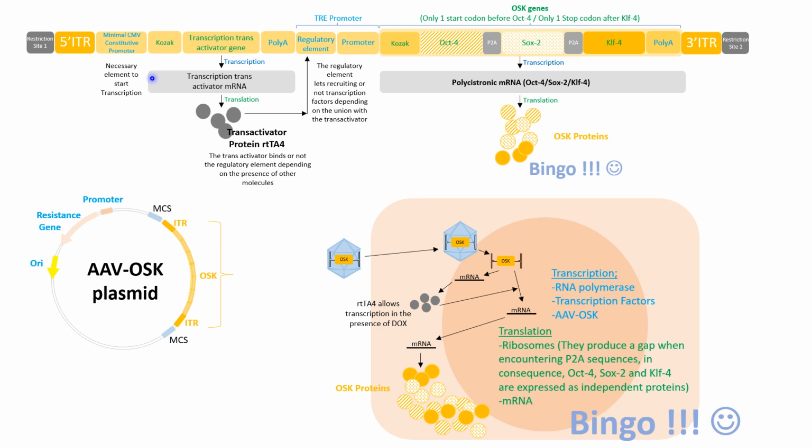Okay, so let's go for it. Let's see first the first gene and the information involved in the transcription of this gene. You have first a CMV promoter, the cytomegalovirus promoter. It's a constitutive promoter. Constitutive promoter means that it's constantly promoting transcription. Okay. Then you have a poly A. So the promoter is going to favor the initiation of the transcription of this fragment.